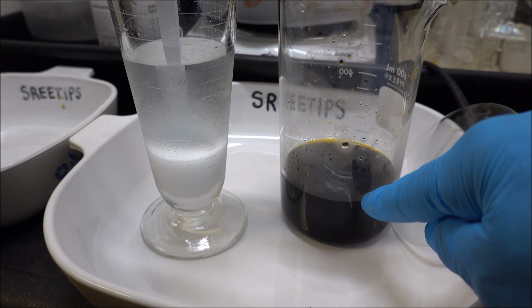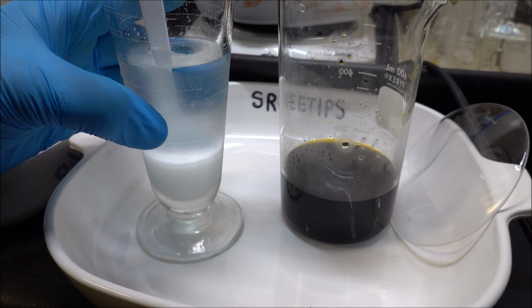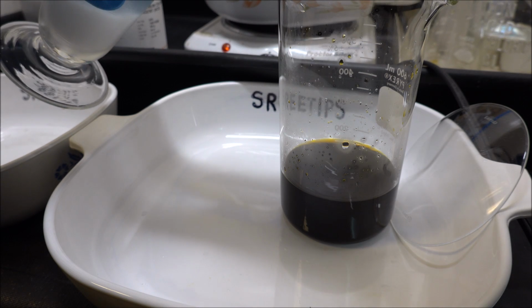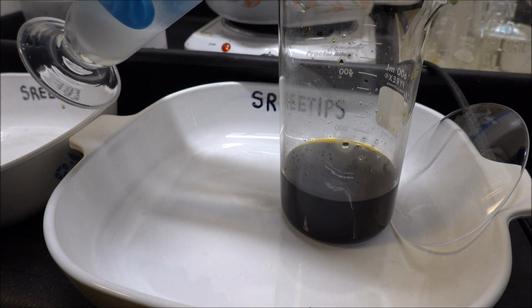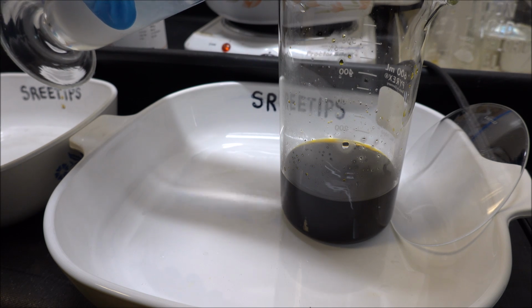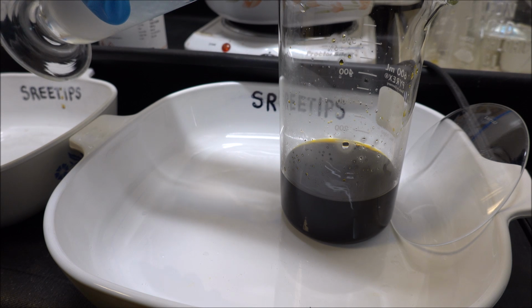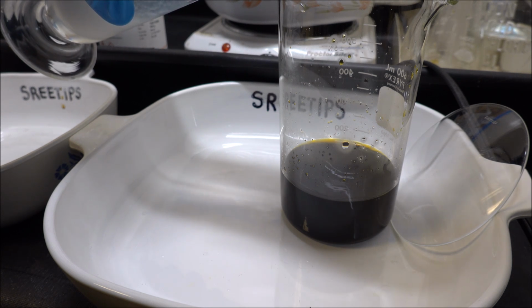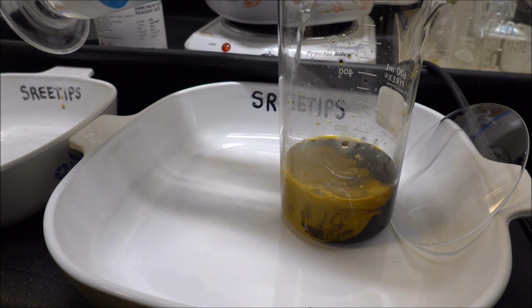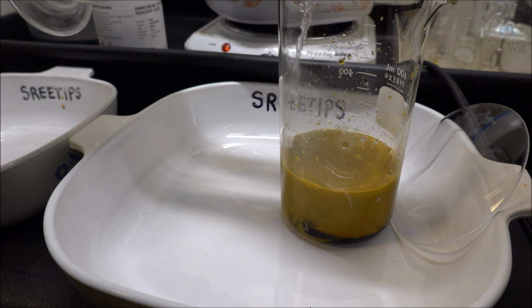Alright, here I go. All set up to do this. I've got my platinum group metals here. I've got my ammonium chloride solution concentrated here. I'm going to go ahead and pour this in and see if we can get the platinum to precipitate. Also, the ammonium chloride is needed to go to the next step and get the palladium. Alright, here we go. This is where I messed up last time I tried to do the video.